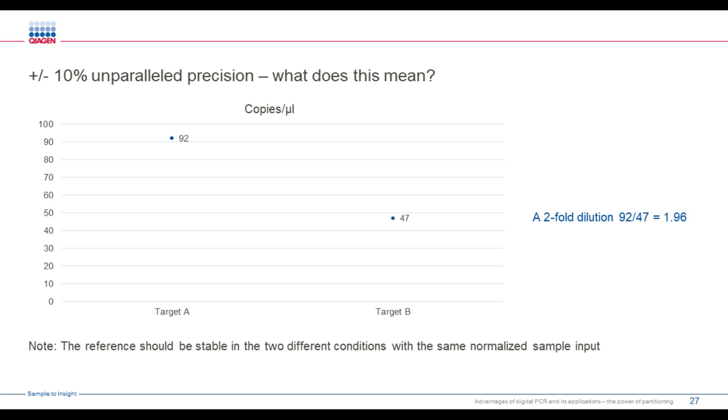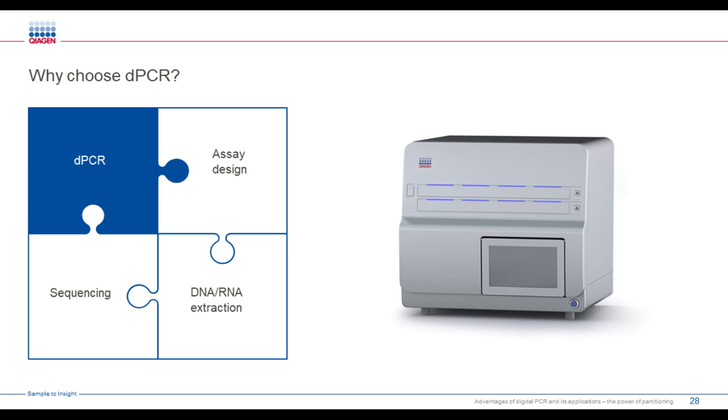As you can see, you can for sure get a lot more data points inside, and this is quite nice to see. So when do you want to do digital PCR? Well, that is entirely up to you, I would say.